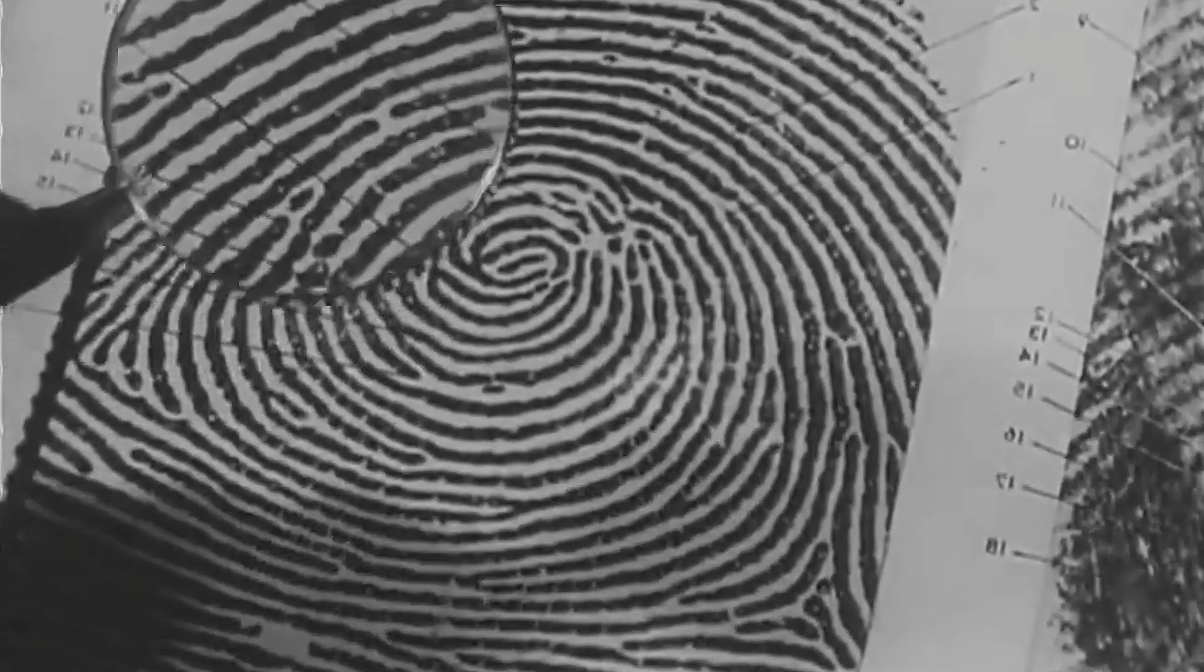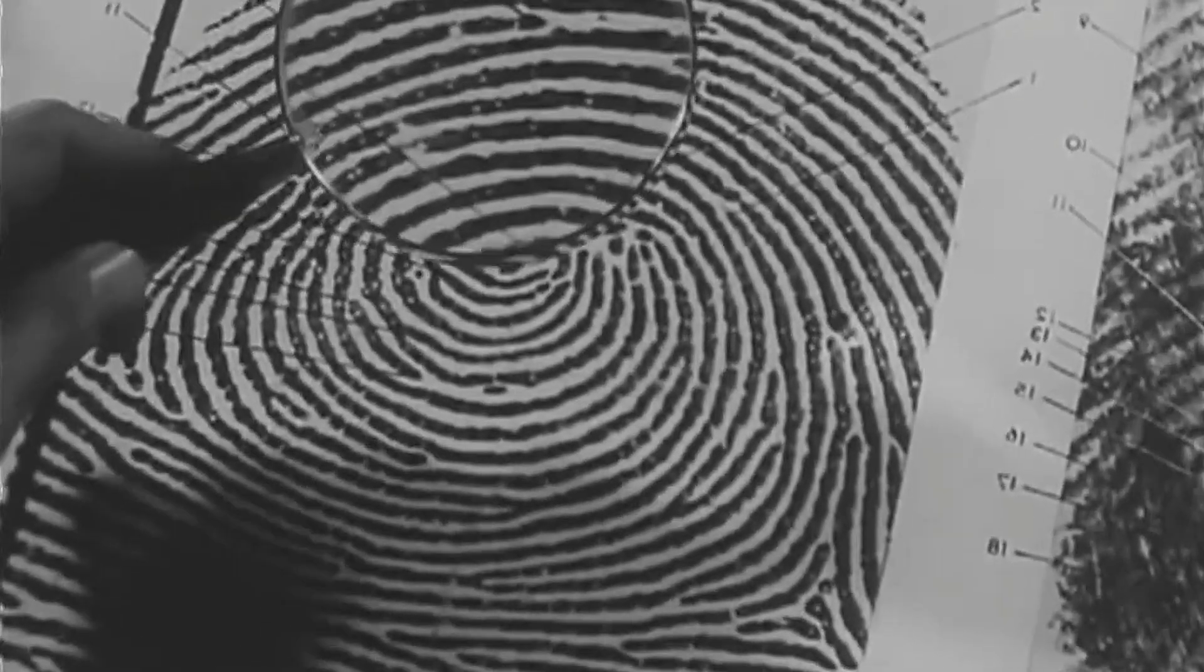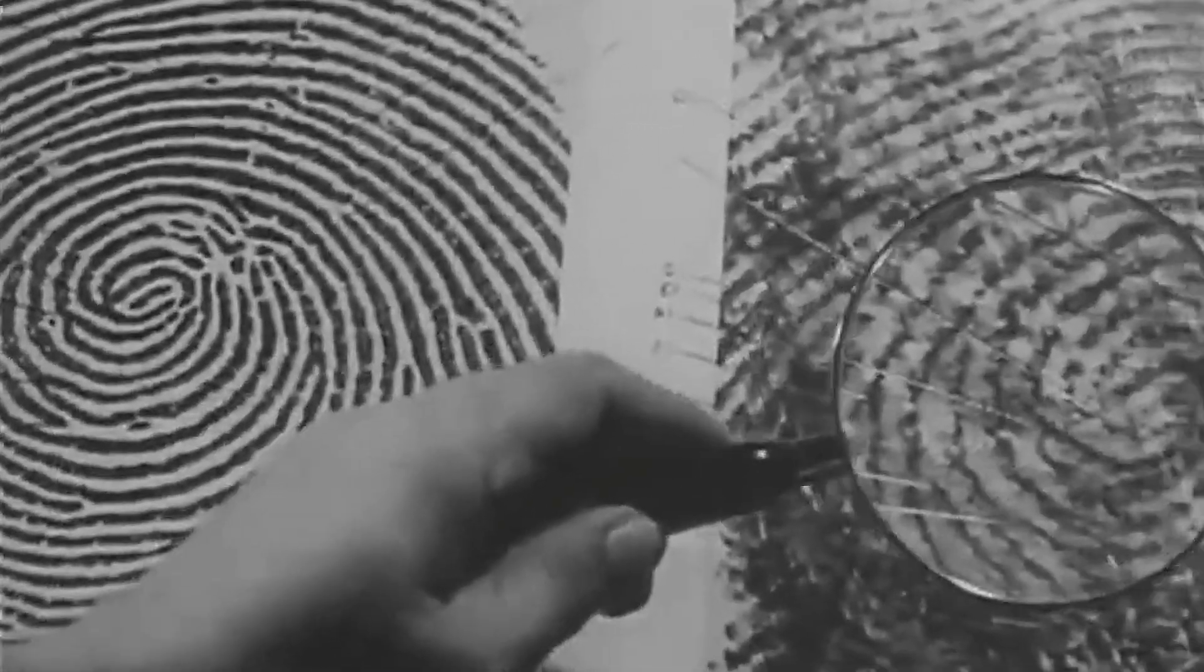Around the same time in the late 1970s, forensic scientists in the UK, Canada, and Japan all independently discovered that superglue could be used for latent fingerprint development.